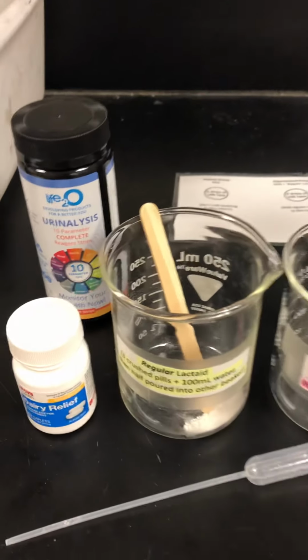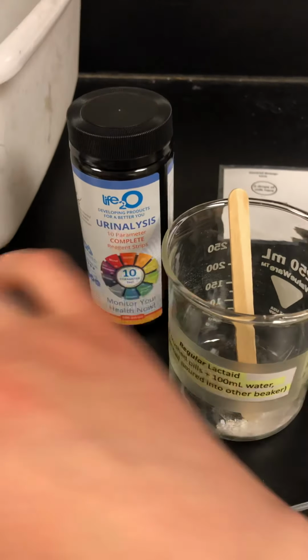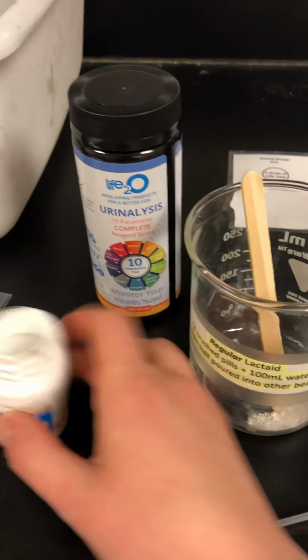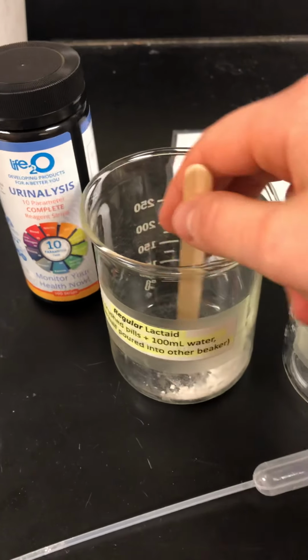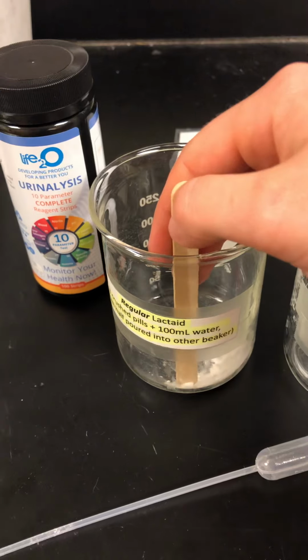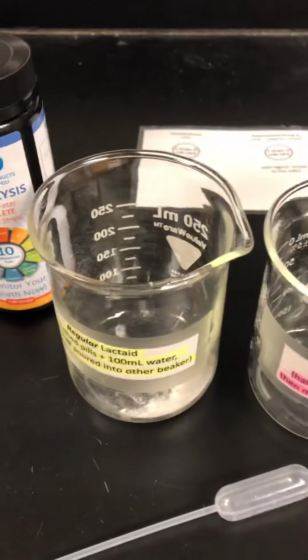Okay, so the first thing we're going to do is take 3 pills out of our Lactaid. So they look like that. I already put them in here, and then I just crushed them up with a popsicle stick. It helps to hold them against the side and smash them up against the side like this. So I've already done that.